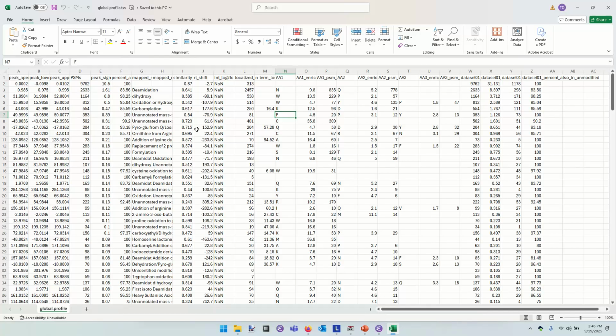I was wondering, if you were to look at the data, you would be able to spot the localization of a mass shift based on wrong distances between adjacent Y ions or B ions. Yes. And so, presumably, this identification of a plus 50 modification on a phenylalanine is based on some sort of mass shift between a phenylalanine and the previous amino acid. Yes.